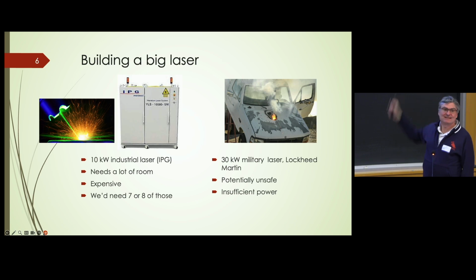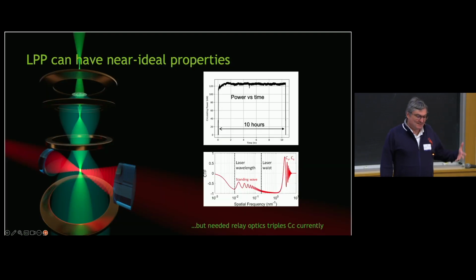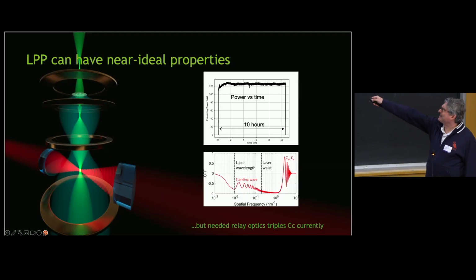This is a military laser designed to do damage to stuff, and it's not powerful enough, and it's potentially unsafe. So what are we to do? What we are going to do is recycle the laser beam. So this is a schematic of the whole thing.